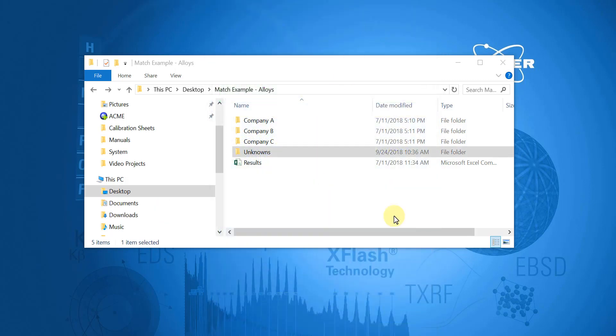For this example dataset, we will assume that we have to match unknown scrap metals to reference materials coming from company A, B, or C.